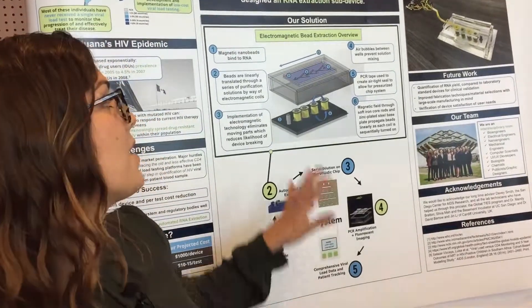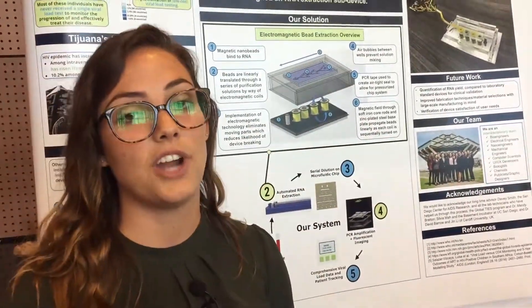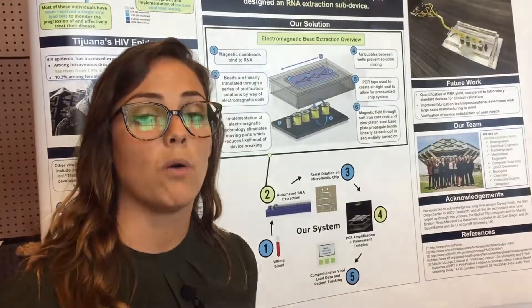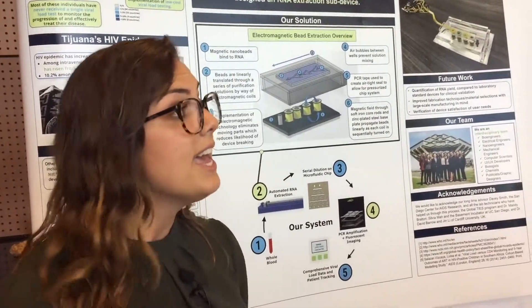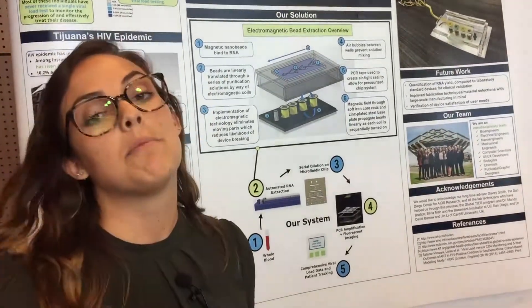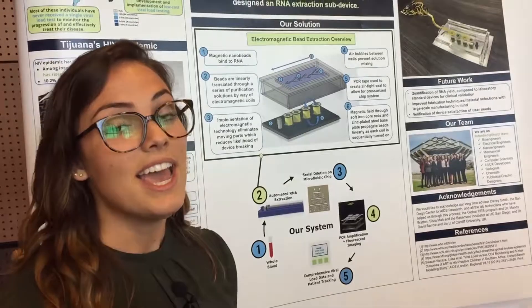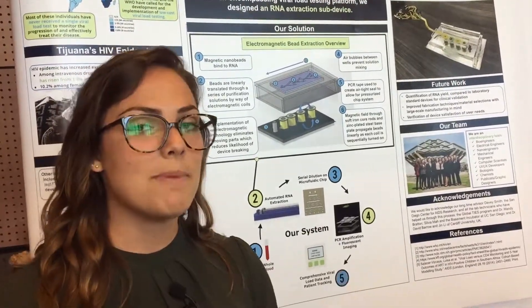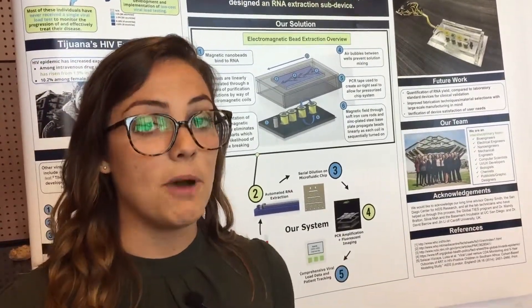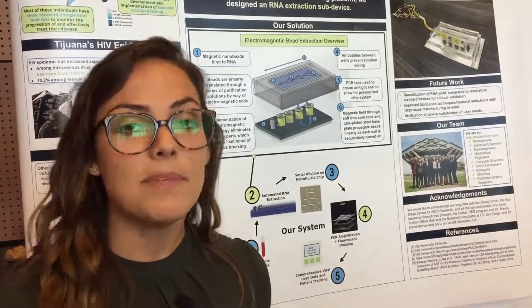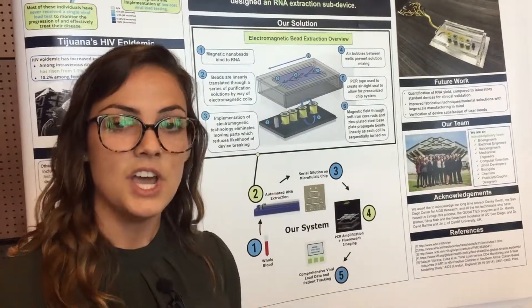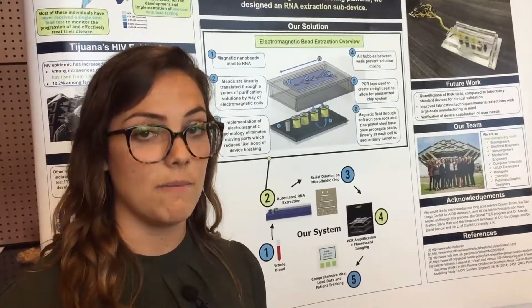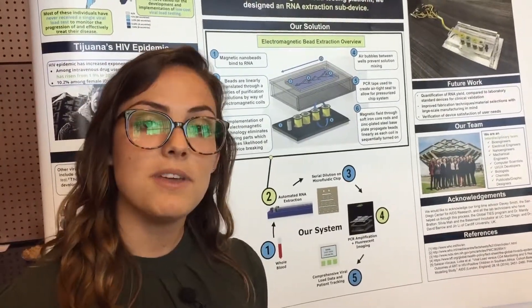For this part we focused on automated RNA extraction, and something a little bit unique about what we did is we decided to implement electromagnetic technology. Through this we are able to minimize the amount of moving parts, which is something that Global TIES really stresses when you're doing humanitarian development.